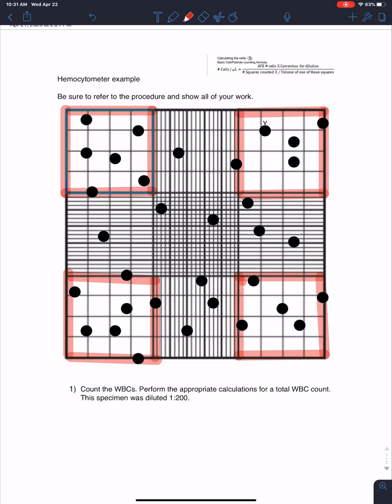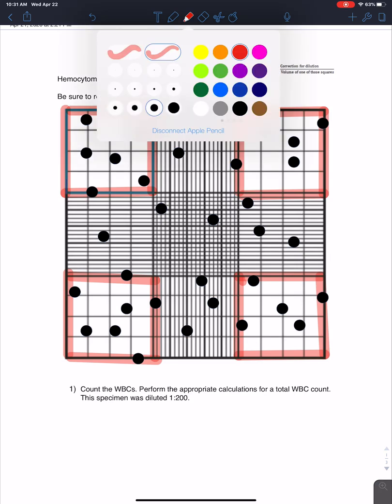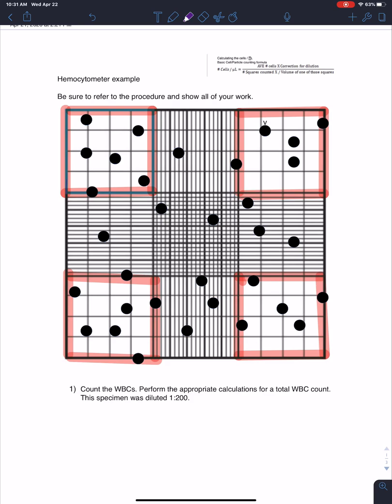When we count, I'm actually going to change colors here, because when we count these cells, we want to count the cells that are inside or touching the top of the square and the left of the square. When we're in that square, we're not going to actually count the cells that are touching the right or the bottom. Okay, so let's go, and we do this methodically so you don't lose track of where you're at.